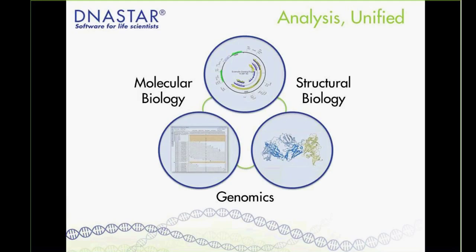Fred Blattner at the University of Wisconsin, DNASTAR's commercial efforts were originally focused on DNA sequence analysis and molecular biology software. As the fields of molecular biology, genomics, and biochemistry evolved, so have we, providing tools for next-gen sequence analysis and most recently for protein structure analysis and protein structure prediction. In addition, all of our software is available on a desktop platform as well as on the DNASTAR cloud.